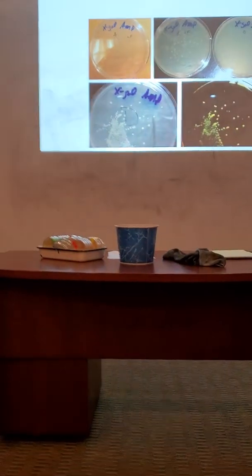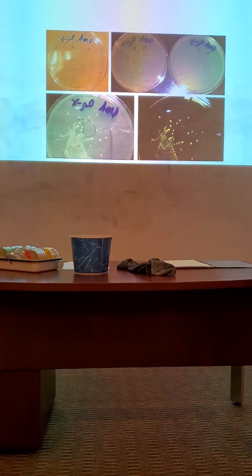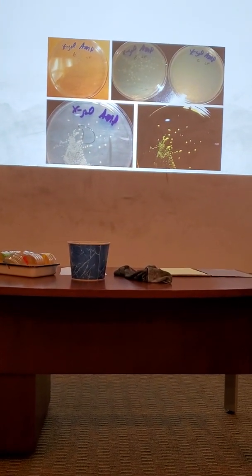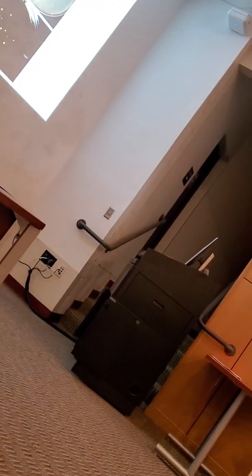But these cells and the cells transformed with sample D also seem to have picked up the new phenotype, the ability to survive in the presence of ampicillin. Then I turned out the lights so you could see that these were actually glowing. It's kind of rough to see. Maybe it's easier to see now that the plates have cooled down. They didn't glow at all when they first came out of the incubator.